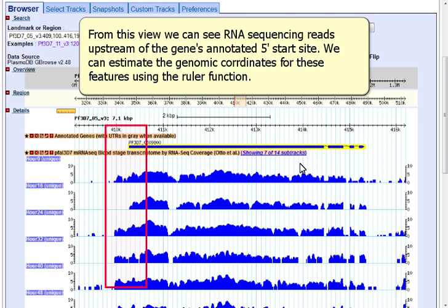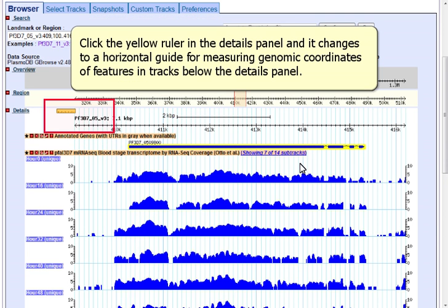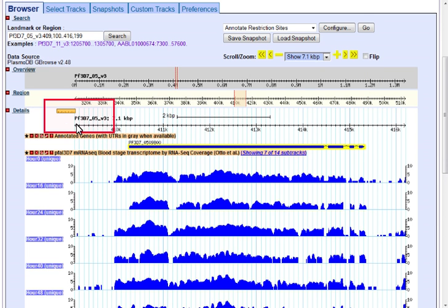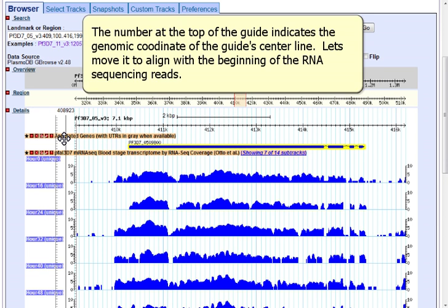We can estimate the genomic coordinates of these features using the Ruler function. Click the yellow ruler in the Details panel and it changes to a horizontal guide for measuring genomic coordinates of features in tracks below the Details panel.